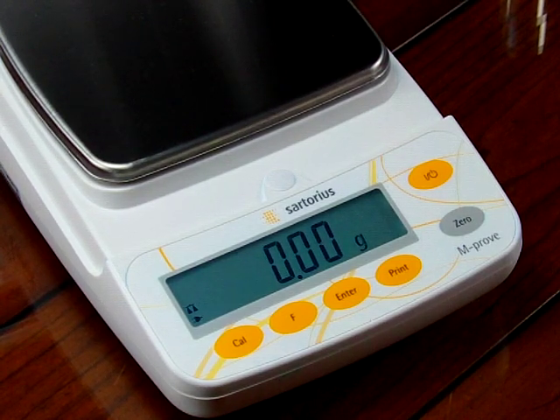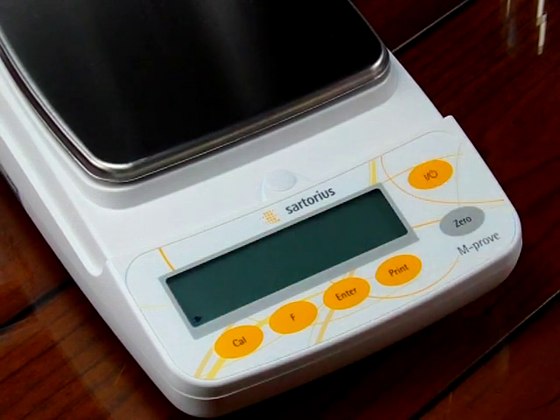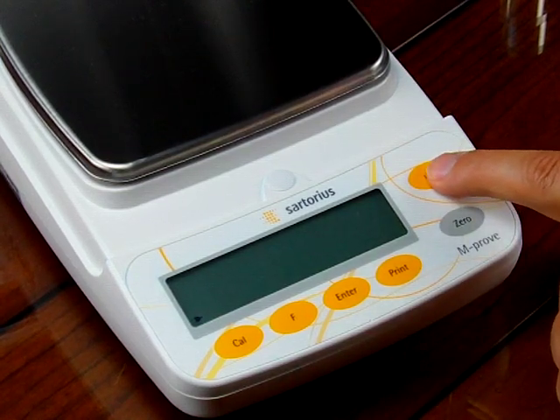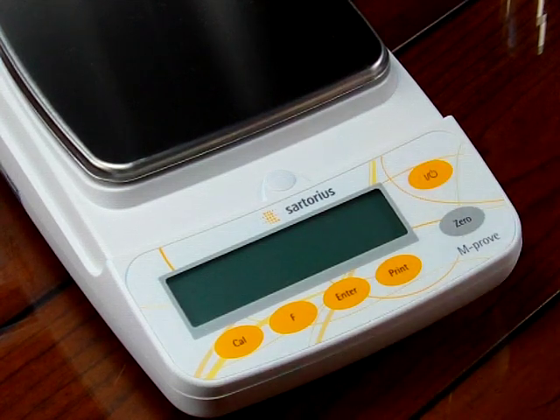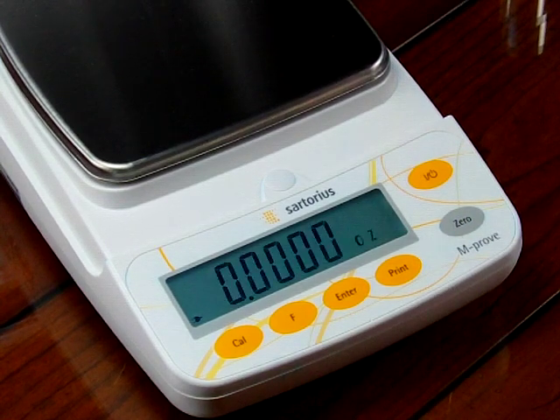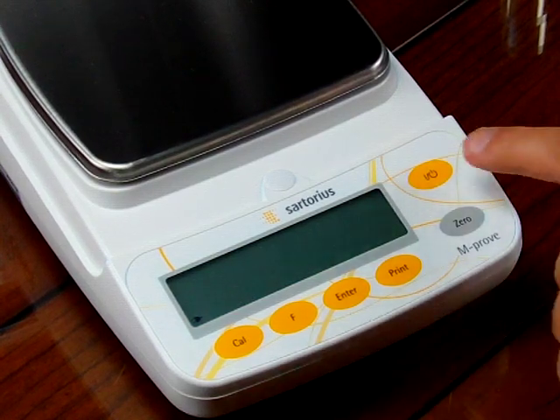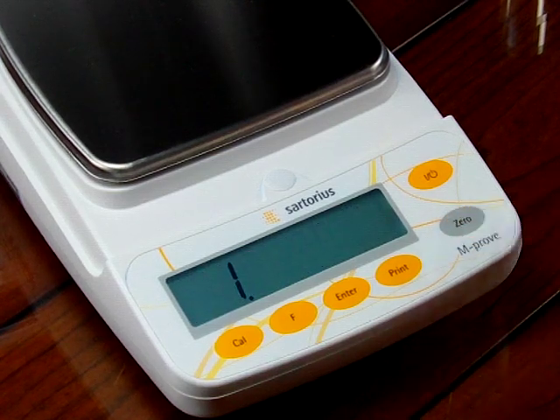The way to do this is we need to turn off the balance. When we power it back up and all the segments are illuminated, we're going to briefly press the zero key. So we turn on the balance and then press and hold the zero key while it's illuminated — and there's the one, which is where we want to be.